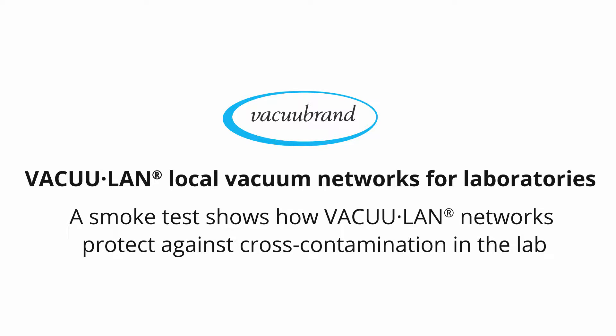VacuLand Local Vacuum Networks for Laboratories. A smoke test that shows how VacuLand networks protect against cross-contamination in the lab.